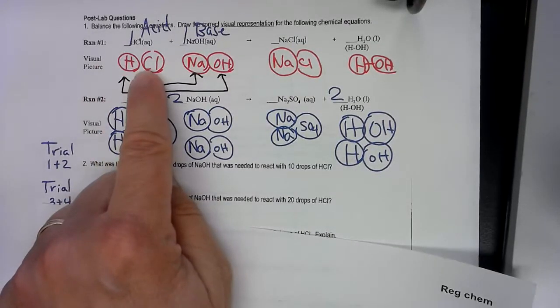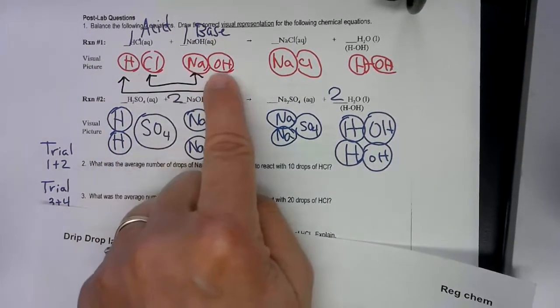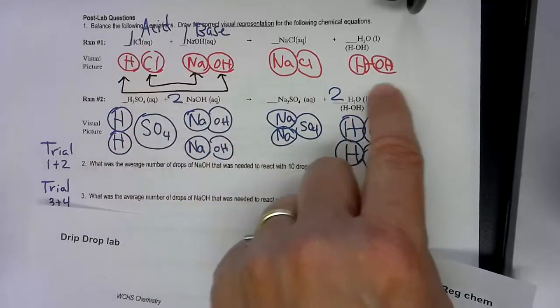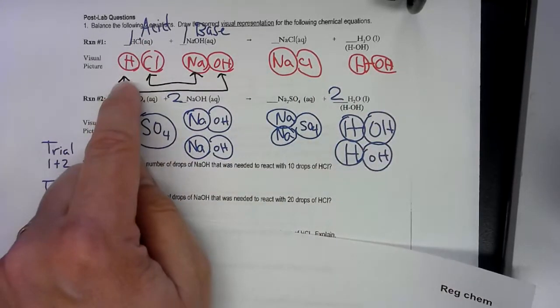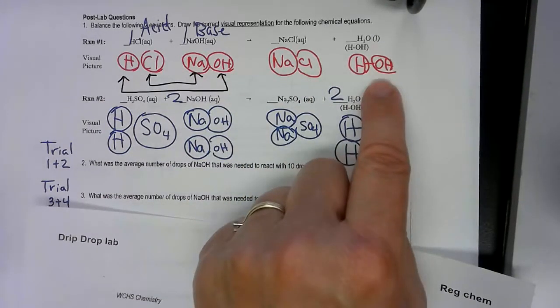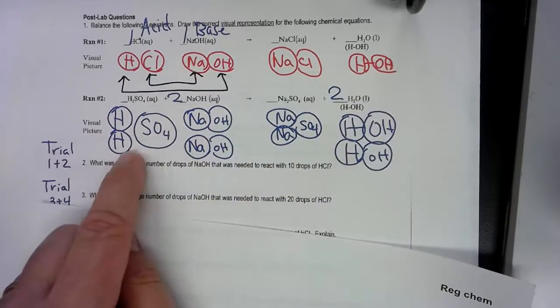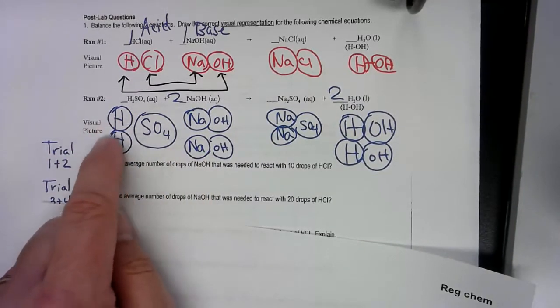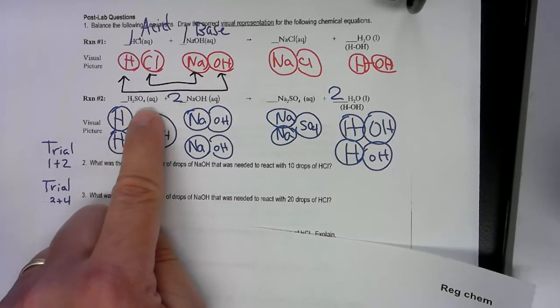realize you're going to do HCl, and you have NaOH, and you have 1 of each because of the way it's balanced. You're going to have 1 of everybody because there's 1 ion of H and there's 1 ion of OH, and that's what makes the neutral water. You're going to do the same thing again, but you have to double the NaOH with the next one because it's double the H's. It's H2SO4.